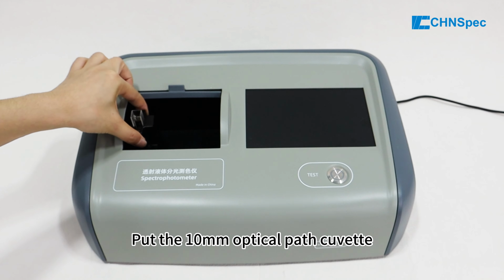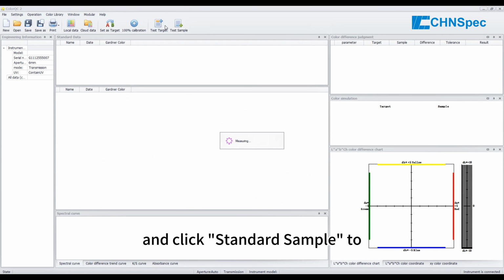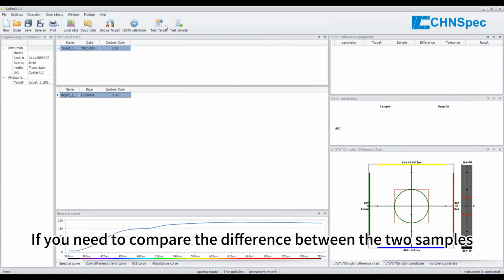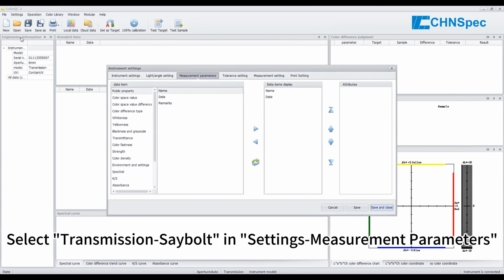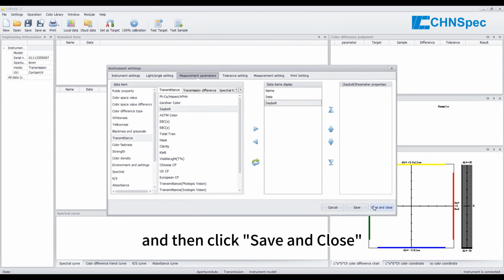Put the 10 mm optical path cuvette containing the sample into the fixture and click Standard Sample to get the Gardner chromaticity 3.38 of the sample. If you need to compare the difference between the two samples, you can put another sample and then click Test Sample for comparison. Third, Saybolt. Select Transmission Saybolt in Settings Measurement Parameters. Click the right button to put it in Display Data Items, and then click Save and Close.